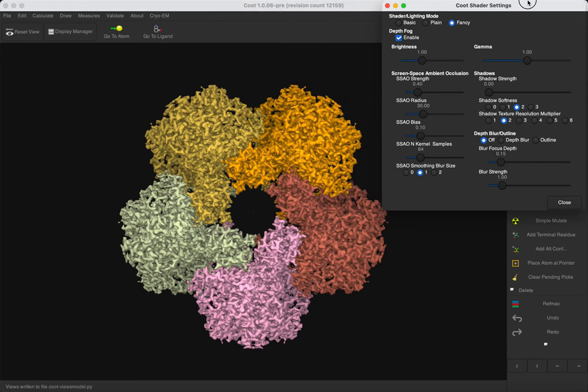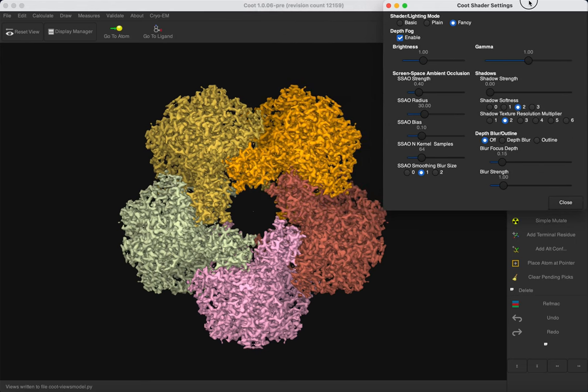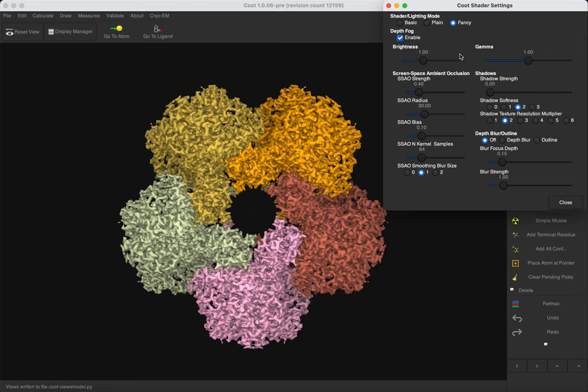The basic and the plain modes are more straightforward and do not use the frame buffers. The basic mode, in fact, uses lines for the model so that Coot can draw it faster. You can also increase or decrease the brightness.